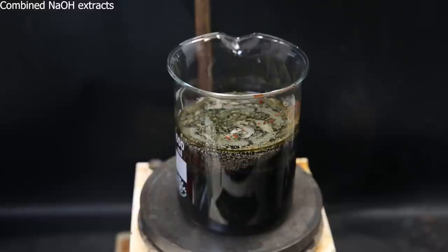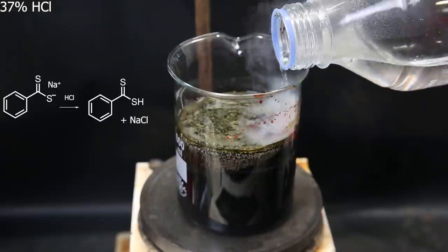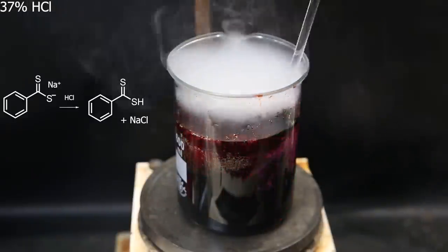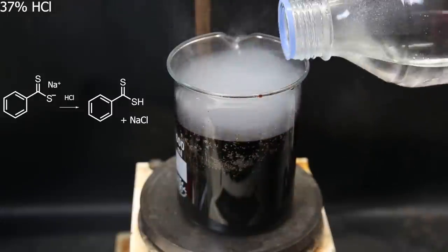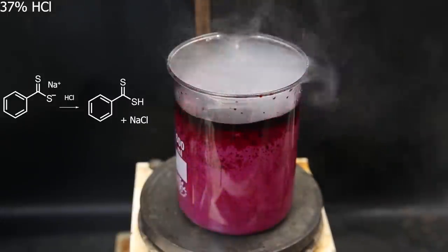Now I have the combined extracts, and some solid potential impurities are floating around. Now to return the dithiobenzoic acid back to its protonated form, I acidify the water again by adding concentrated hydrochloric acid, until the dithiobenzoic acid separates out.